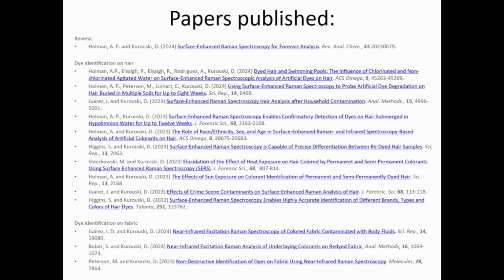So if you're interested, please read this paper. It summarizes not only SERS-based identification of dyes, but in general the use of surface-enhanced Raman spectroscopy in forensics. It's also a very interesting fact that as a spin-off of this project, we had an undergrad who was very interested in forensic spectroscopy and forensic research, and the undergrad expanded this approach that we developed for hair to enable detection and identification of colorants in fabric.